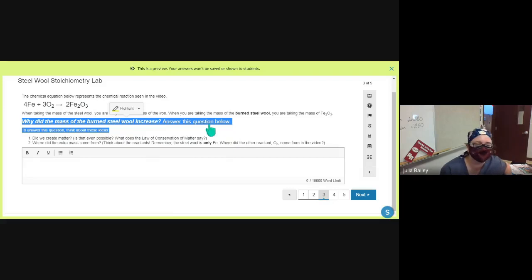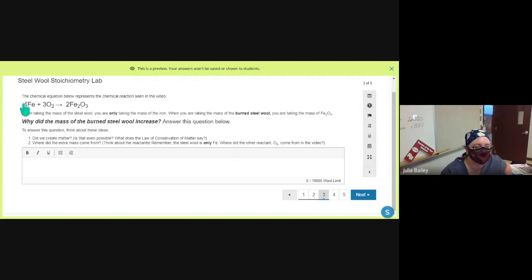And you have to think about some ideas to answer this question, but the bottom line here is that we started with iron, that's the steel wool, it's basically iron, and then we lit it on fire. How does fire work? What do you need to make a fire happen? You need 2 things, right? You need a fuel, and then what's the other thing you need for fire to work? A fuel like wood or food is normally, or like gas on a gas stove, normally what we think of. Or in this case, it was the iron. And then, yeah, oxygen. You need oxygen for fire. You need fuel and you need oxygen.